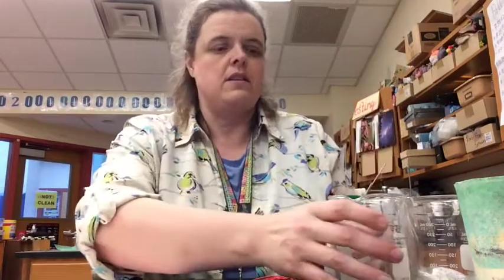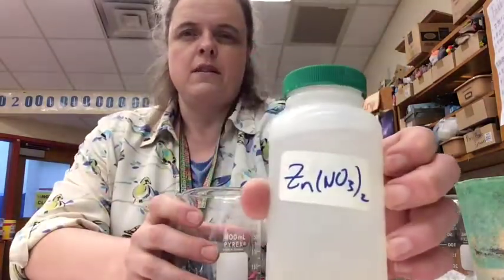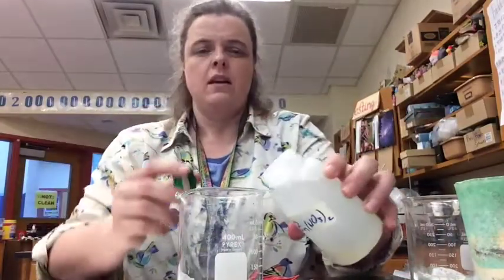Chemistry students. So today, what we're going to be talking about again is redox reactions. And I want to actually show you some of them and show how we can actually use these things. So we're going to start with some zinc nitrate. So we've got some zinc nitrate in this container.